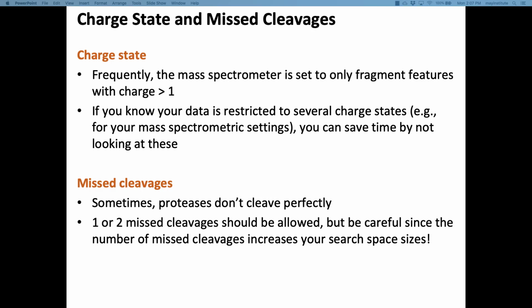With different fragmentation, different ionization techniques, however, you also see different types of ions. So you need to know that. And if you change the conditions, that might result in different distribution of these charge states. Missed cleavages, that is something that happens. Sometimes these proteases do not cleave perfectly. Sometimes that's also desired. If you know that, you need to put it in, because it basically means that your peptide can also contain lysines and arginines with tryptic cleavages. If you know that occurs a bit, you can find new candidates by setting this parameter, or you can fix your experiment and make sure your digest is properly done.